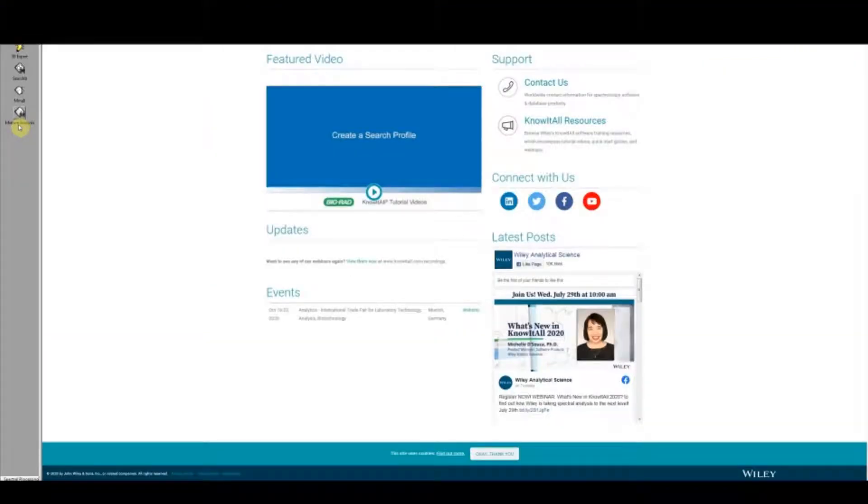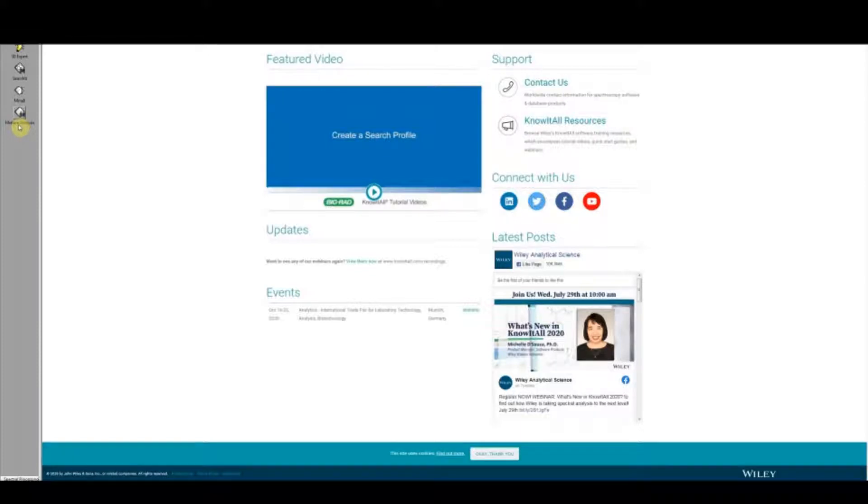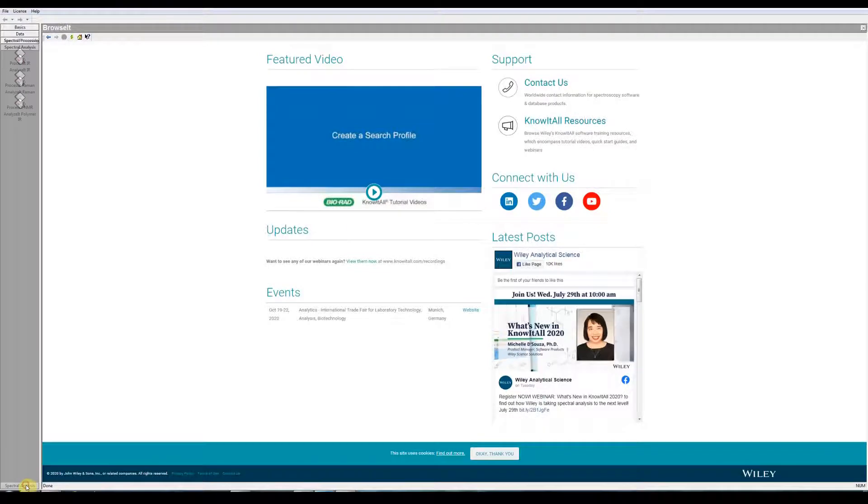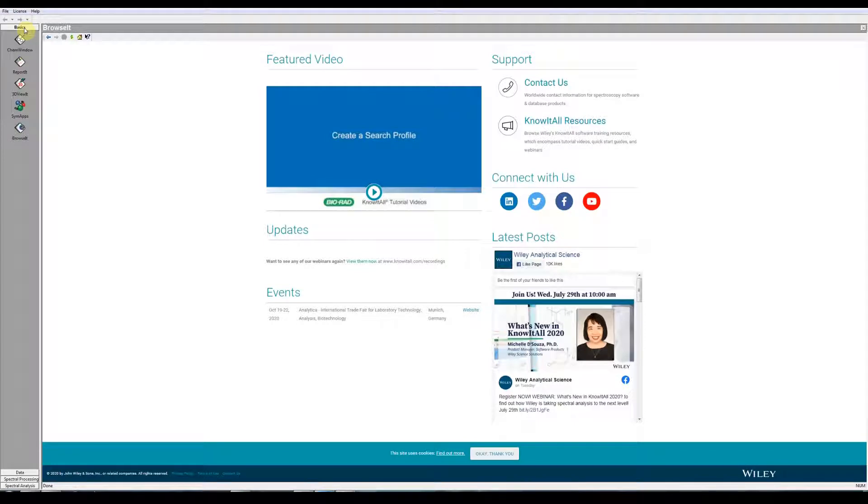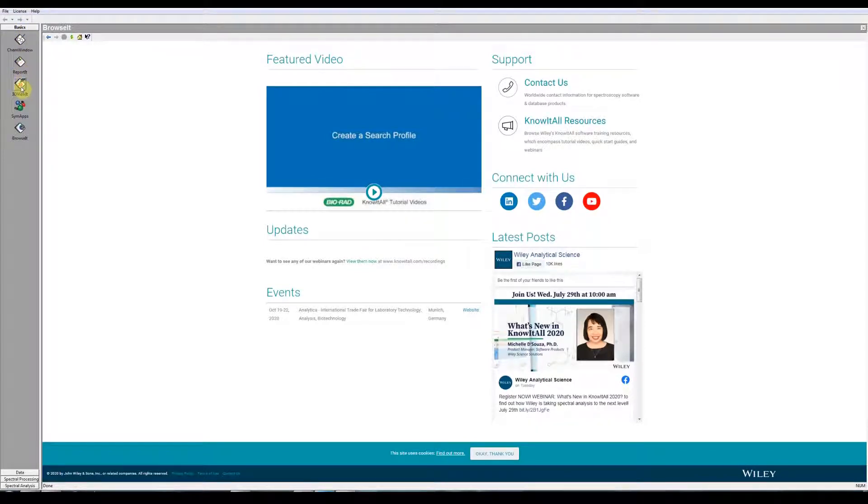When you open the software, this is the default screen. There are four different applications within Know-It-All, and there are applications within those applications. So it's a multi-function program. Many of these applications, like Search-It, Mine-It, Mixture Analysis, Spectral Processing, Spectral Analysis, many of these are disabled or only barely functional in this freeware version. We'll be using the basic group here, specifically ChemWindow, Report-It, 3D View-It, and SymApps.